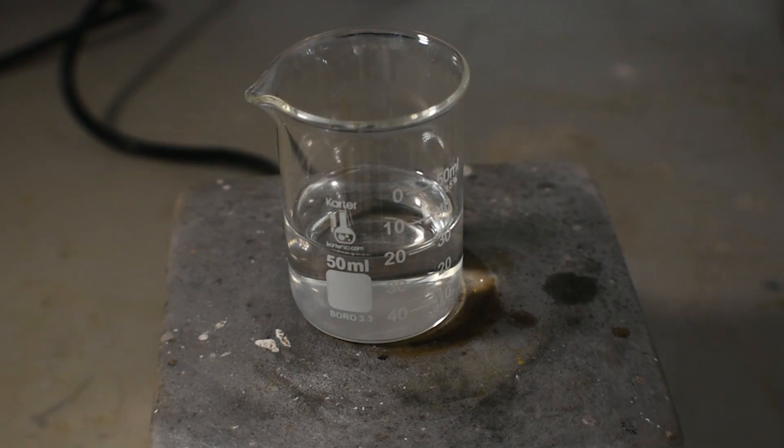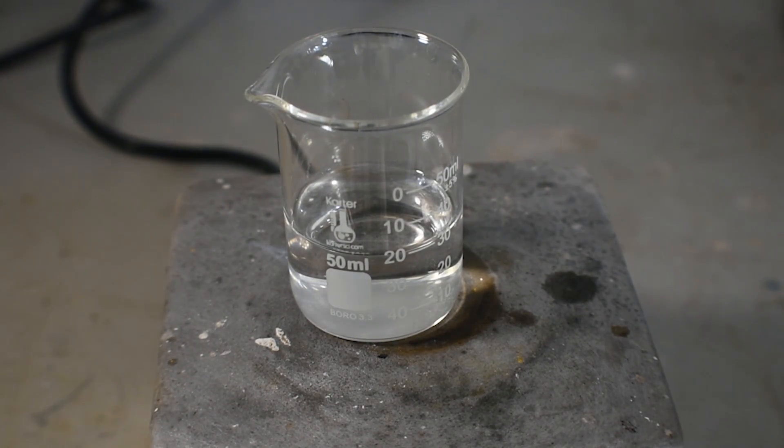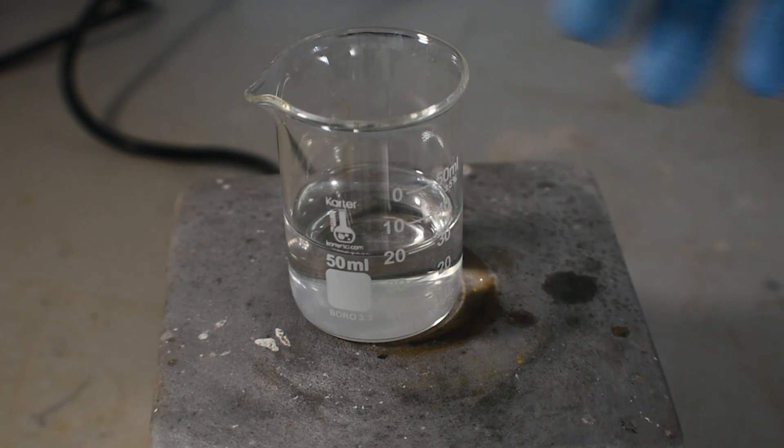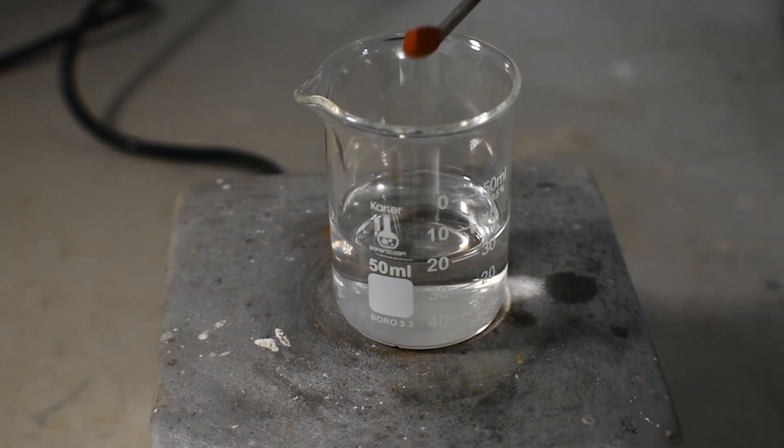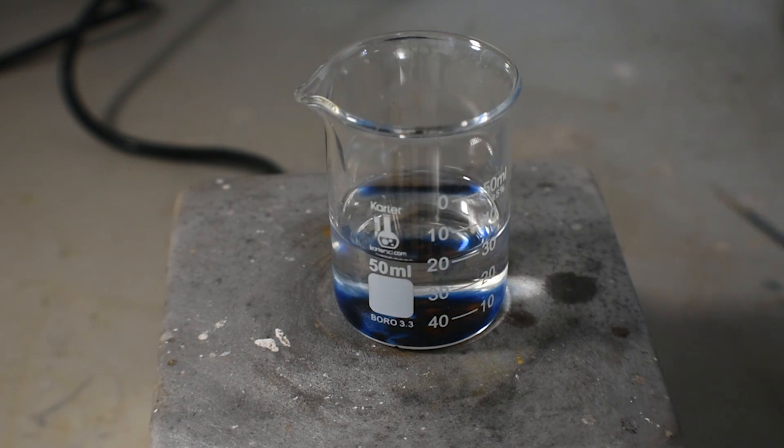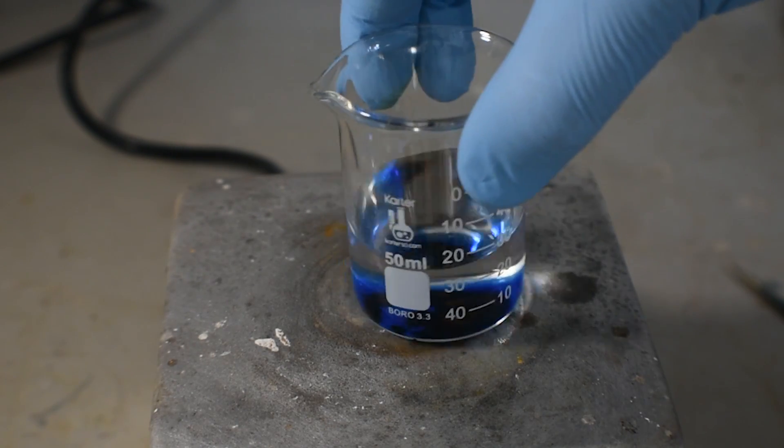The second test I'll do involves adding the salt to aqueous ammonia. My ammonia has a concentration of 10%. Upon addition, the solution turns a dark blue color, indicative of a copper-2 amine complex.